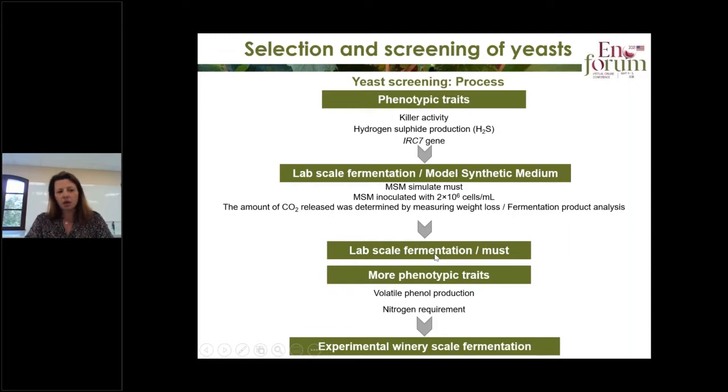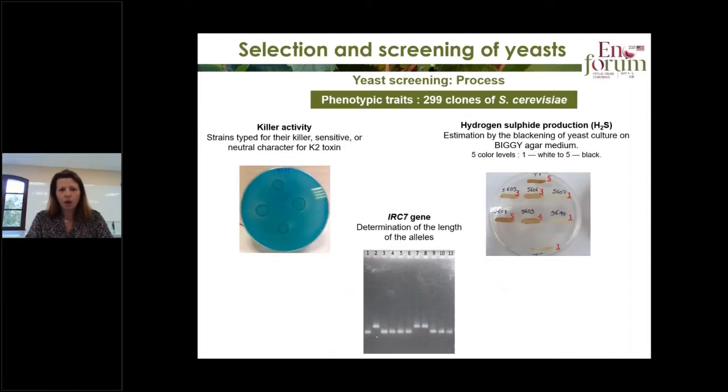All these tests allow us to select the most efficient yeast for experimental winery scale fermentation. For this study, we characterized around 300 yeasts.